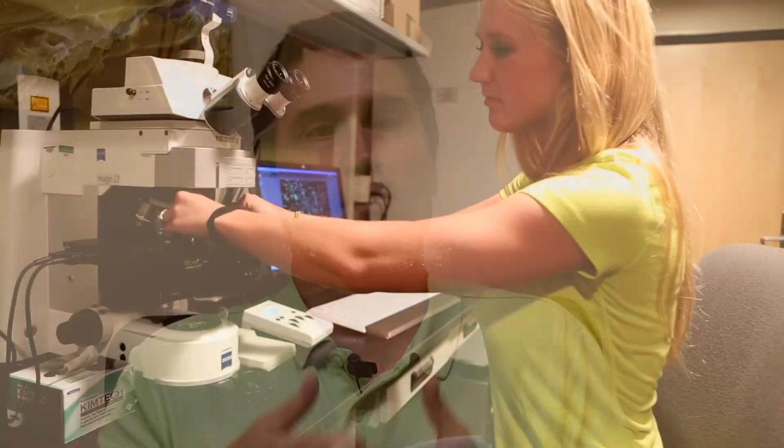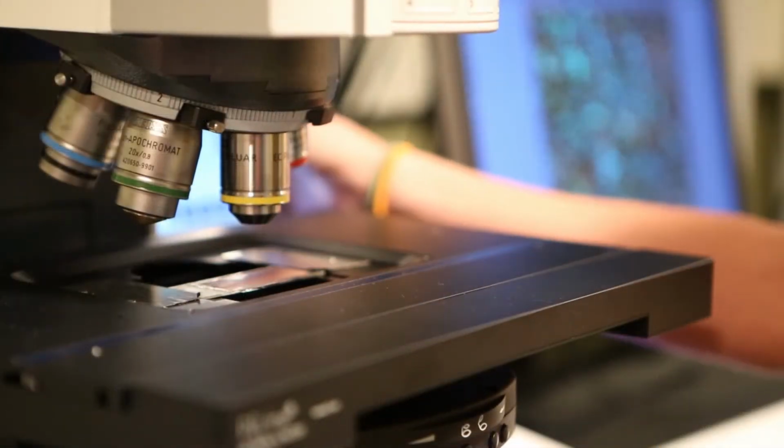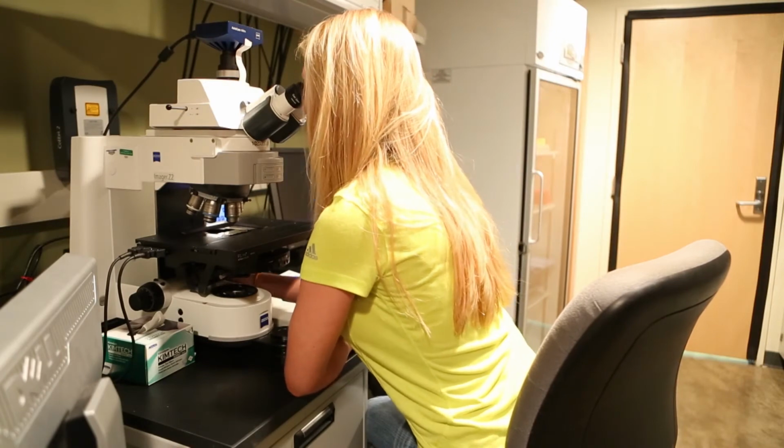So once we have the culture dishes and the plates set up to actually do the experiment, a lot of times what we're going to be testing is how different drugs work. What that means is we're going to be adding drugs to the cells and either waiting 2 hours, 4 hours, or overnight. And then we'll actually look through microscopy at what's going on inside the cell. So we're looking either at specific proteins that are involved in disease progression, or we're looking at how a drug regulates the expression of that particular protein.